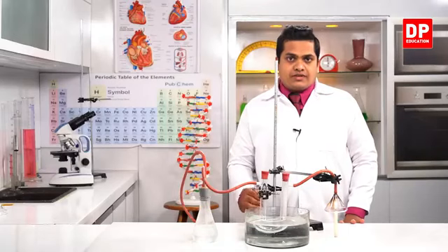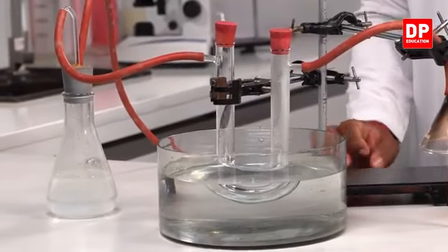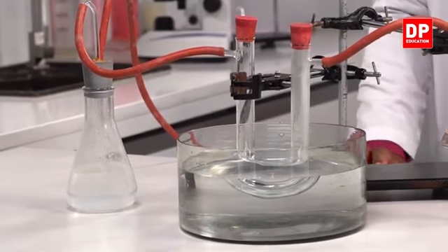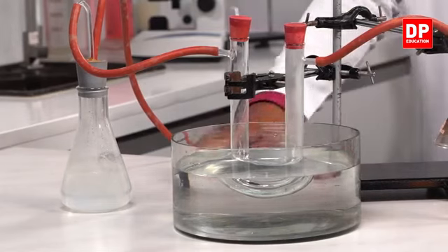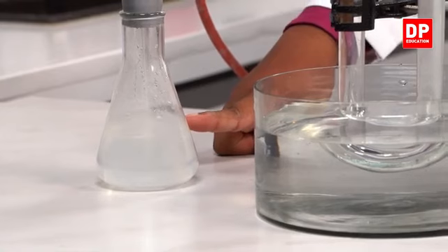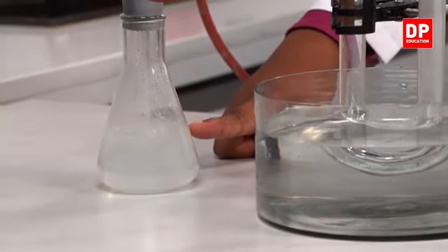So we have to give it somewhat time, right? So that the products which are getting created during the combustion of candle come in contact with the chemicals. So here you can observe now gradually the color of lime water solution is getting converted into a milky white color.